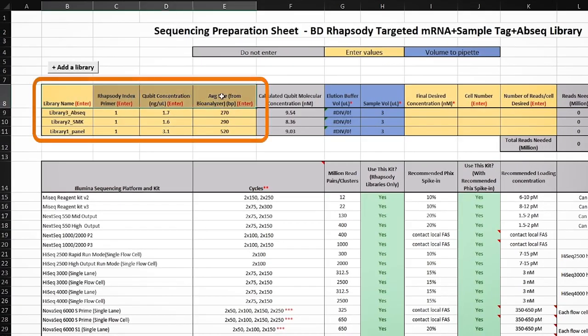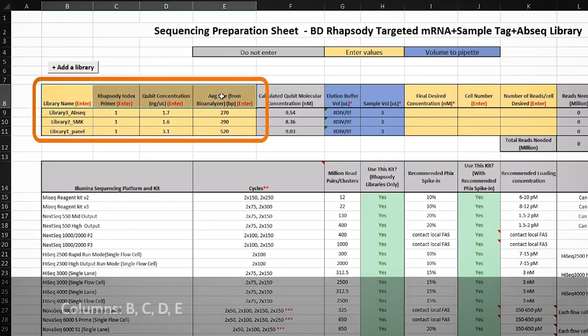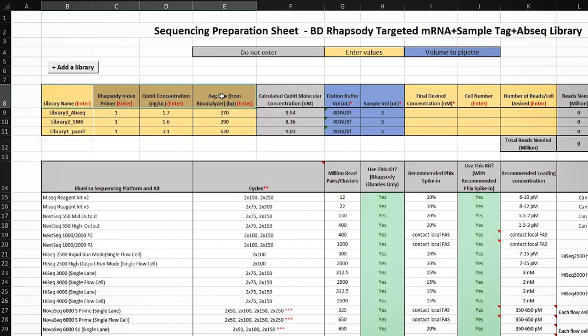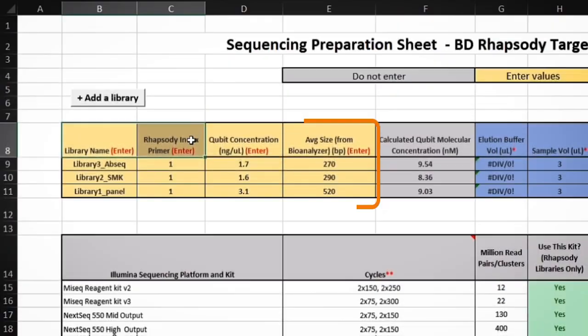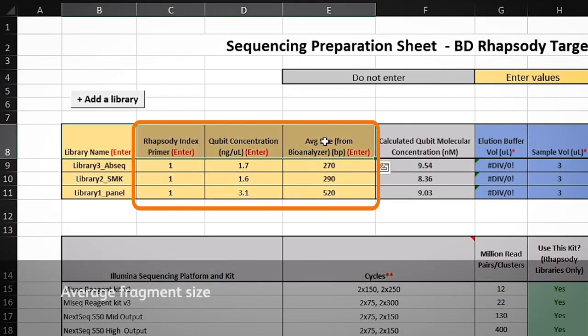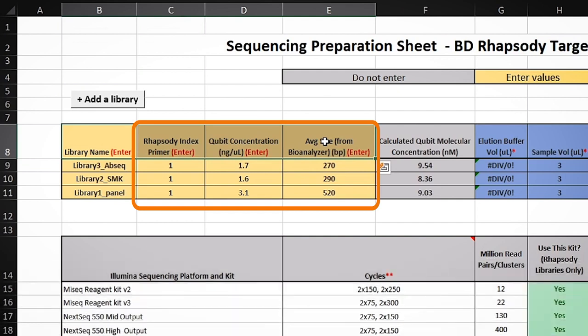The cells in columns B, C, D, and E are there to help keep track of important information for your experiment, including library index used, concentration, and average fragment size. The libraries will also need to be diluted prior to sequencing in accordance with the facility you are using.